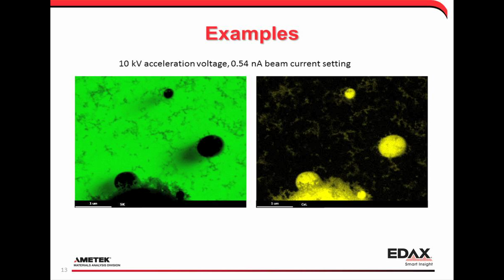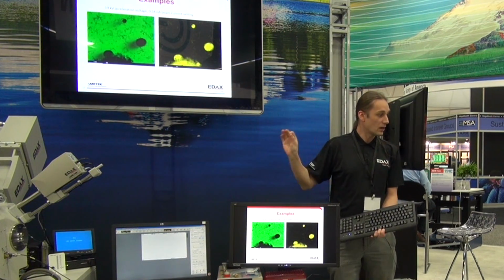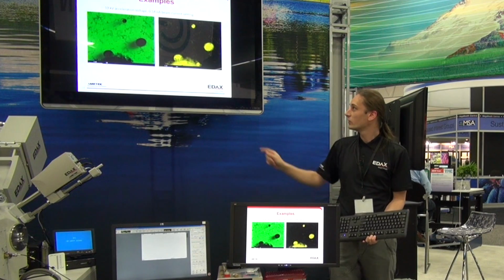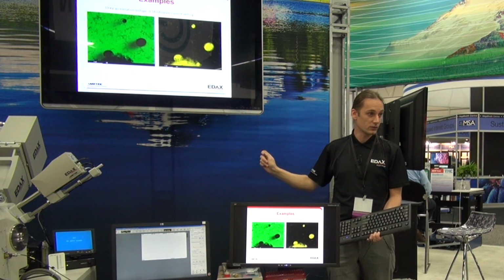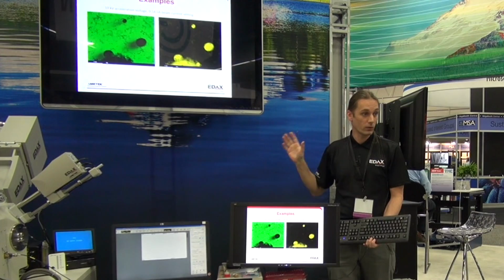And if we look at the cerium map, it's a little hard for you to see down there, but these structures down here, you can actually see they are round particles. The 70 nanometer line I extracted from my SEM image is made up of even smaller cerium particles. So right here we are imaging, in X-ray imaging, 70 nanometer or smaller particles.